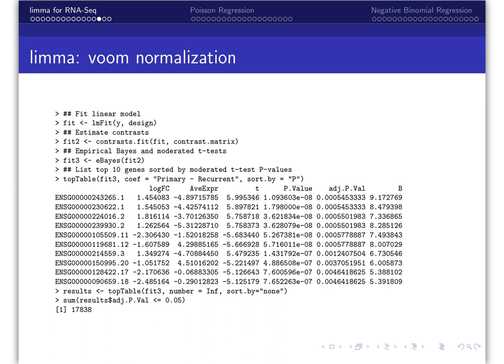In that case, we can view the top differentially expressed genes using the topTable function by specifying we are interested in that specific comparison. Note here that we have sorted by the p-values and that the corresponding B statistics are not always decreasing. We probably want results for all of the genes instead of only the top 10, so we can set the number parameter in topTable to infinity. Now we see that there are 17,838 genes identified among the 60,000.